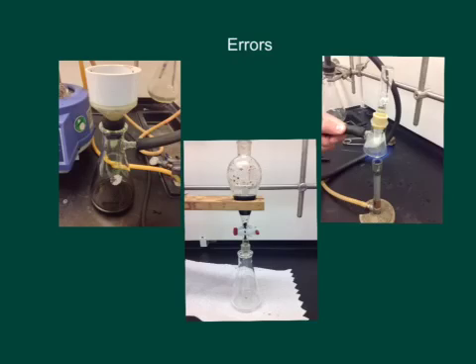Additionally, the filtering system right here to extract the liquid from the leaves after distillation could have also caused problems, because not all the liquid could have been drained, or some of the leaves were drained with the liquid down to the Erlenmeyer flask. And finally, the sublimation of the caffeine could have also caused problems. When heating up the caffeine with the Bunsen burner, the caffeine was being vaporized, but because of the vacuum right here, the caffeine could have solidified inside this little casket of the vacuum, and there would have been a loss of caffeine there, which would have been unavoidable for the student.